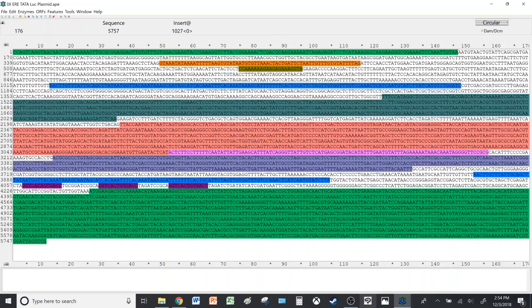You can either translate everything fully, or you can translate selected parts. And you can translate in two fashions. Either you can have the amino acid sequence pop up in this part where the highlighted labels appear, or you can have an extra window that pops up with the amino acid sequence. So let's take a look at both.